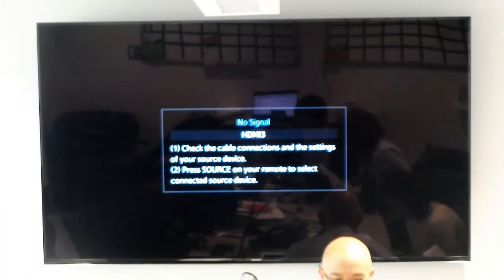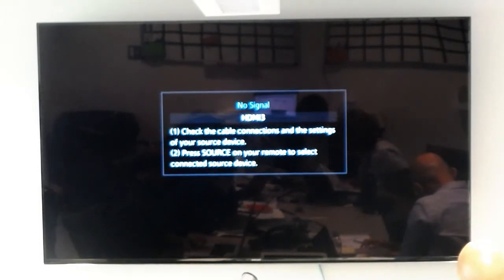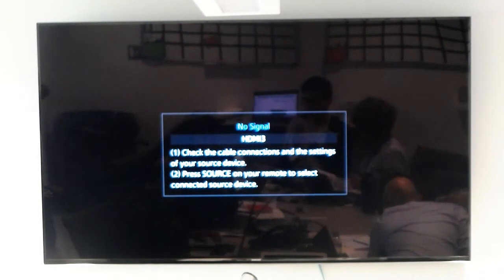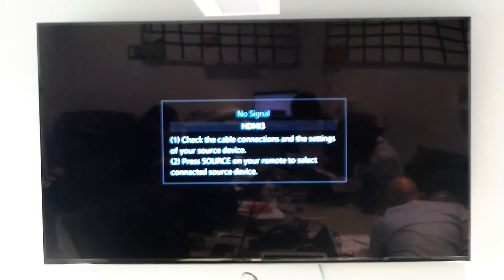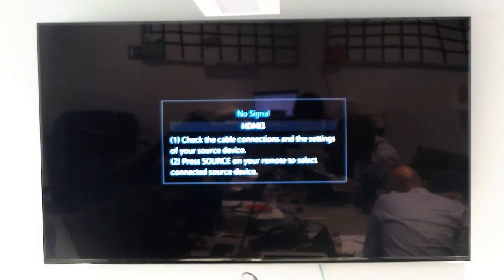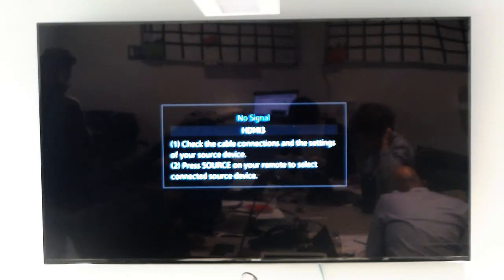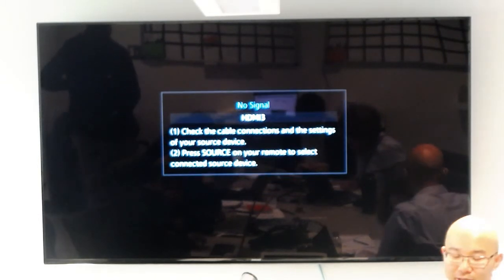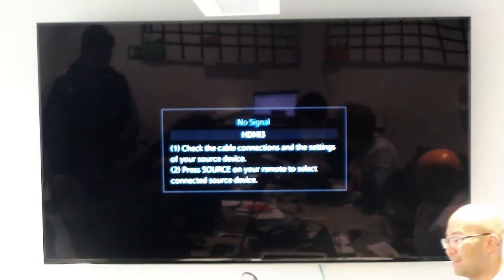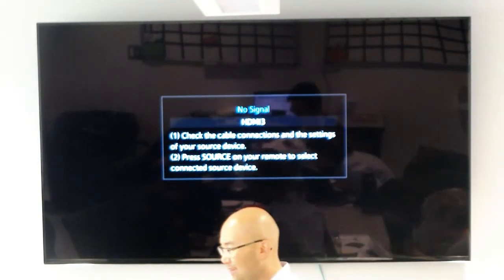Yes, but this is the point of the silly things and just get it set up. Then this is wrong, right? No, that's what I typed in. So it's a couple of minutes, right? No, so if you understand, this is the exact command. But, hold on. Yeah, who can read has this advantage. So then it depends on what it's called. So that's a syntax thing. Yeah, read terminal, don't read line.